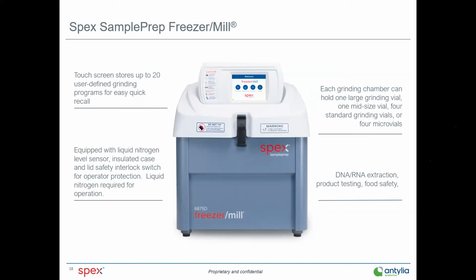Each grinding chamber can hold one large vial, which is about the size of a 12-ounce soda can, and can hold anywhere between about 50 to 100 grams. One mid-sized vial, which is about the size of a Red Bull can. Or 4 of the small vials, which can do about 1 to 5 grams worth of sample. It's about the size of a cigar, and the micro vials are going to be too small for anything that you're doing. They're about the size of a Bic pen.